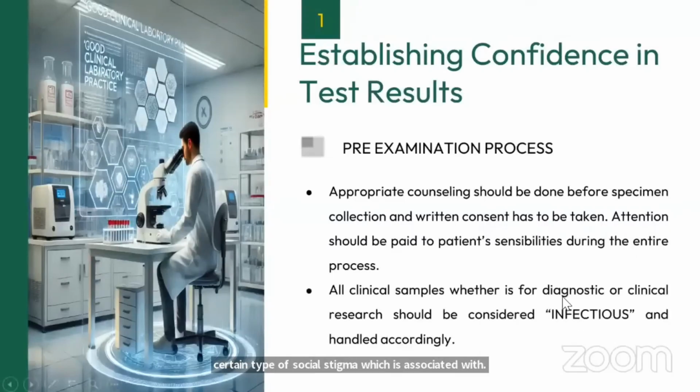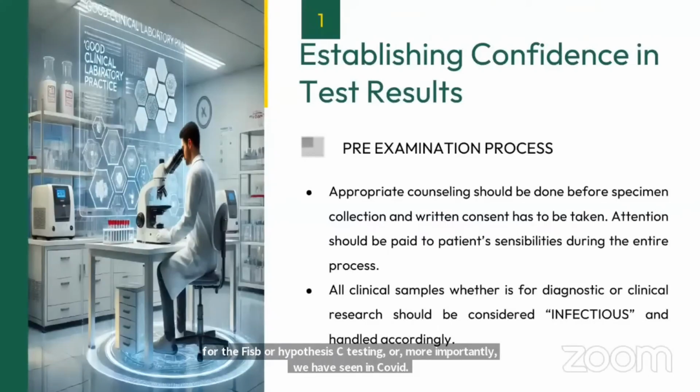All clinical samples, whether for diagnostic or clinical research, should be considered as infectious and handled accordingly. So not only should you consider any HIV sample or any samples for hepatitis B or hepatitis C testing, or more recently, in COVID, not only COVID samples or any specific samples, but all samples as a blanket, whichever is your purpose in diagnostic or research laboratories, irrespective of their status, should be considered as infectious and must be handled as per the universal safety precaution.